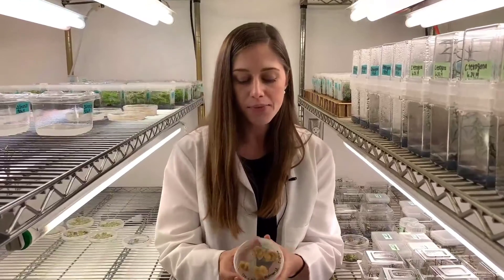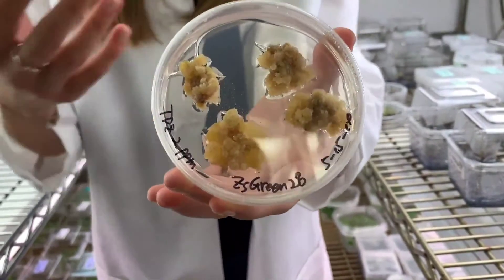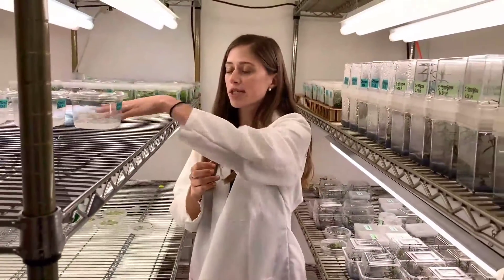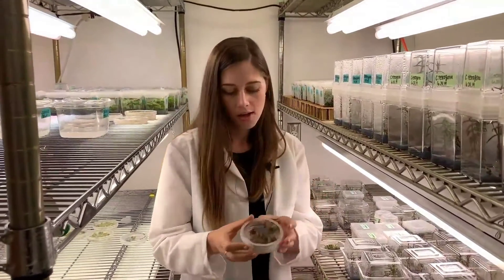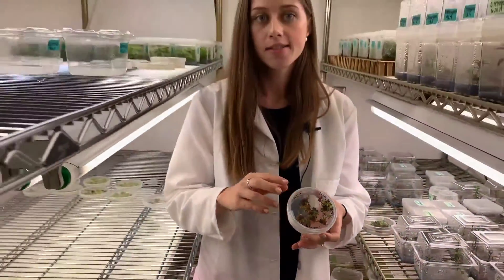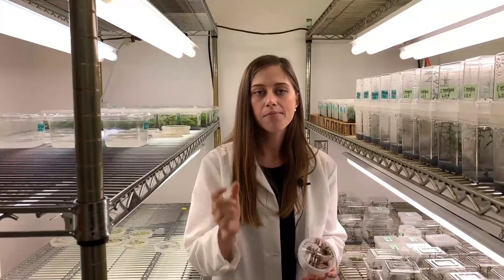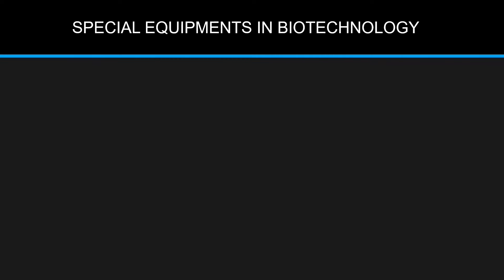We create something called a callus that is very similar to a tumor or maybe an embryo before it becomes differentiated. Next, we switch to another medium that promotes shoots to grow. On here we see the brown callus and the shoots that are now growing up out of it. This is so cool because instead of growing plants from a seed like we normally do, we can make a clone of a plant by cutting up a tiny piece of its leaf and mimicking different developmental stages.